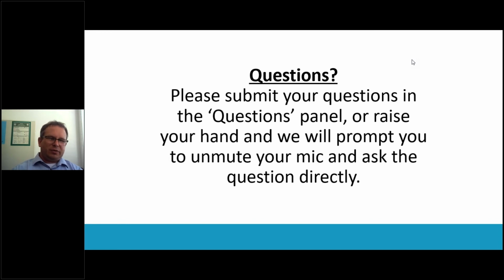Yeah, thank you for this interesting question. Yes, we did experiments on that, for example, by investigating GDLs that were aged in this way with imaging techniques, and we could see that they tend to retain water to a much greater extent than fresh material. So the artificial aging at least qualitatively reproduces the effect of the aging in the fuel cell. Coming to the first part of your question, yes, in the past we also worked with techniques for artificial aging of, for example, membrane material.